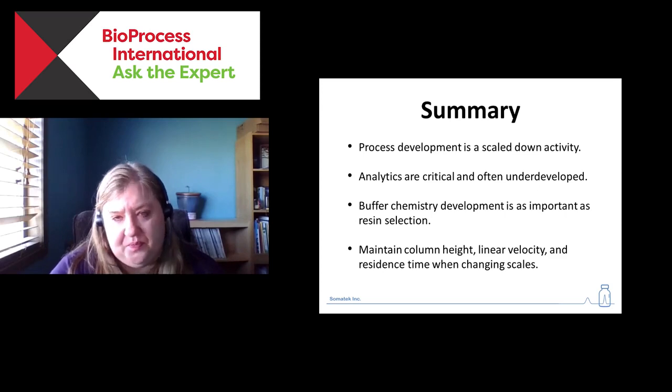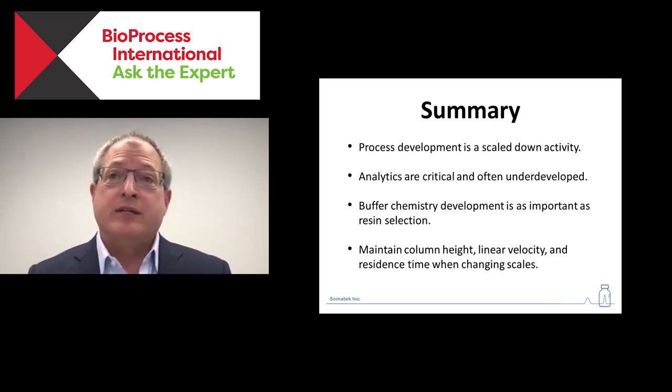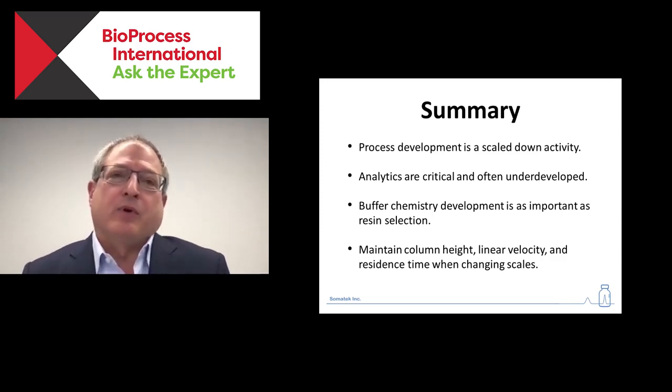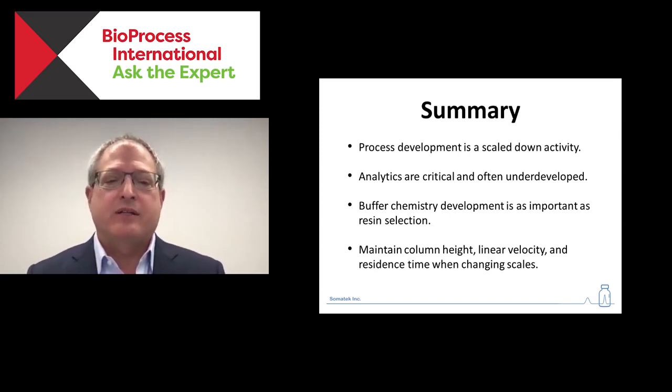Yes and no. The exact process, and I think the audience may have noticed we didn't give exact buffer details. We couldn't. But the exact process, no. But the approach, including the use of the resin and the way we designed the studies, that applies to adenoviruses, retroviruses. It applies to proteins, and so the approach is the one I'd use for an AAV or any other virus. The exact details are going to change as you develop these processes.